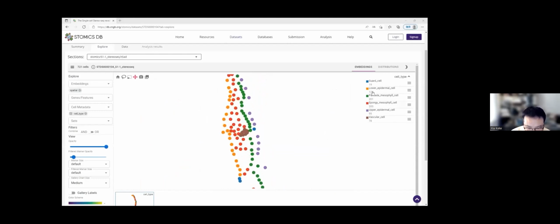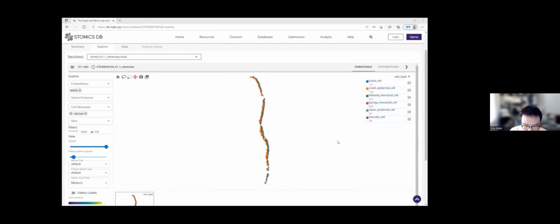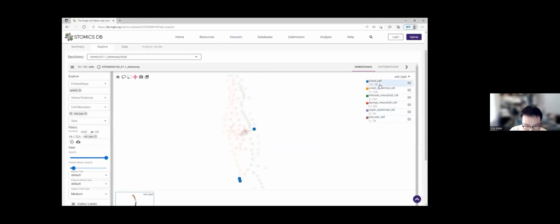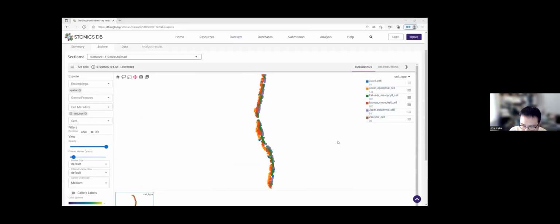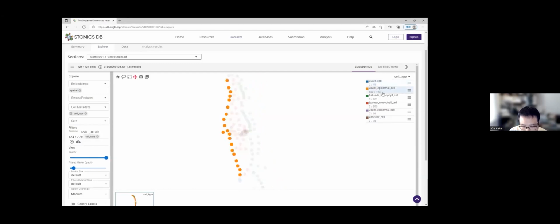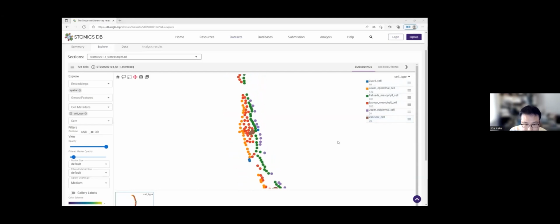We successfully revealed the complex cell type specific and spatial temporal gene expression features of Arabidopsis leaves. The analysis results have been uploaded to STOmics DB, and it's open access. Using this database, we can easily obtain gene expression levels in various cell types of leaves.